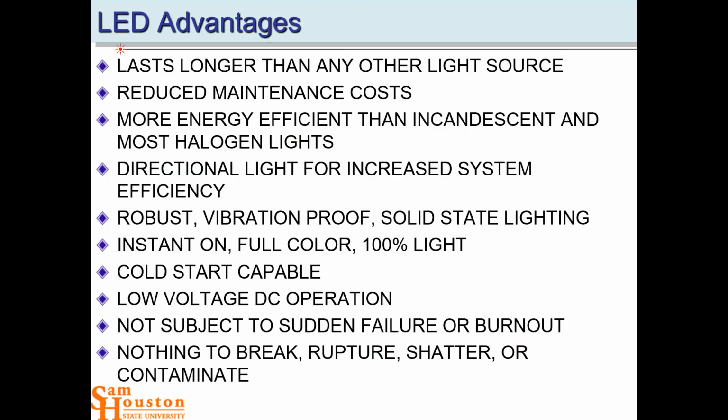The LED advantages: they last longer, and they're more energy efficient. You can drop them. You drop that halogen light, and it's all over, because that little filament inside can break. Now, what's the halogen part of these halogen lamps? Like your automobile lamps are halogens. They used to have floor lamps in people's homes that were halogen lamps. They were tungsten halogen lamps.